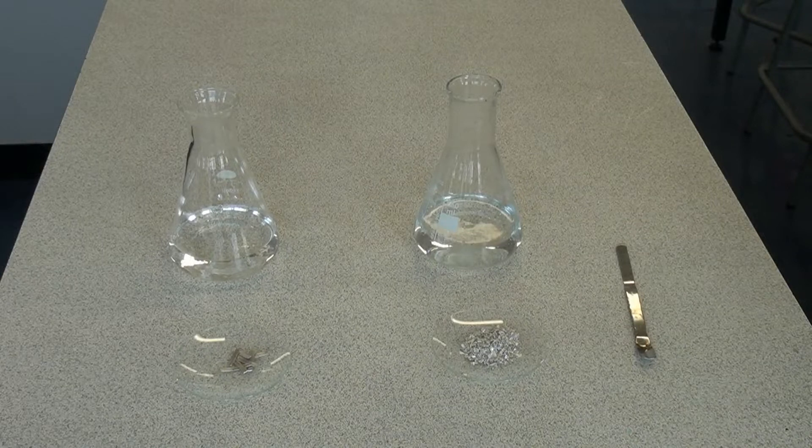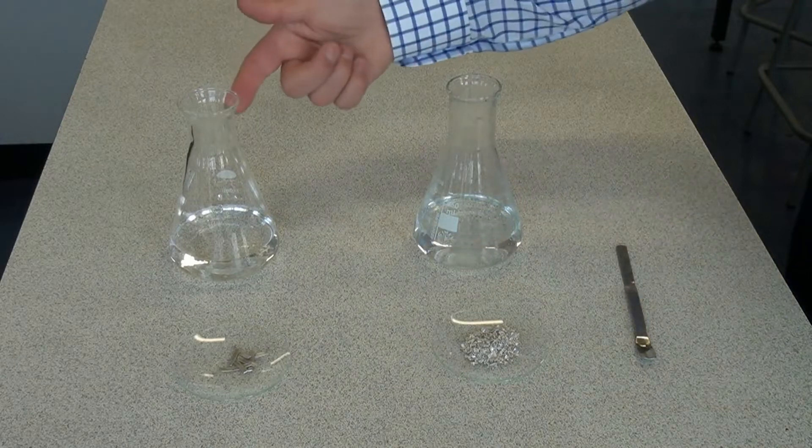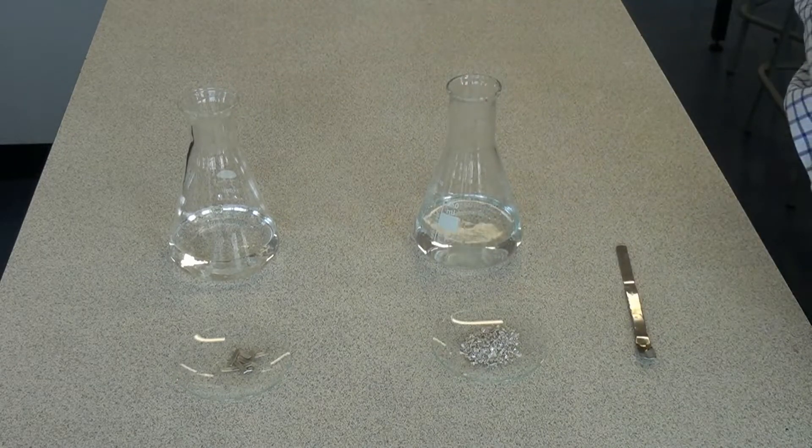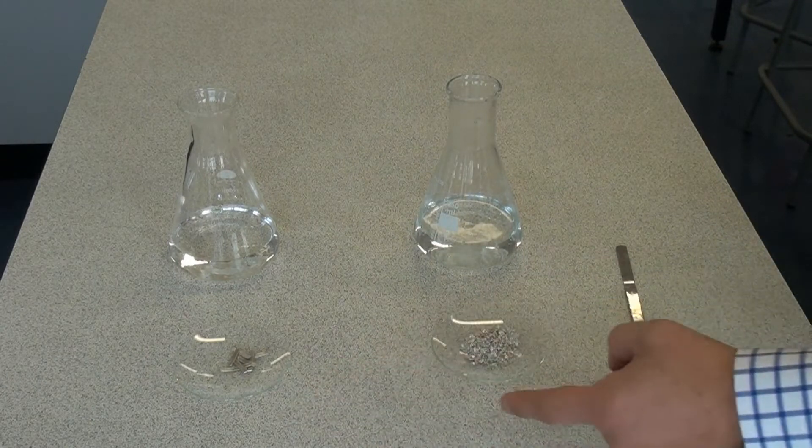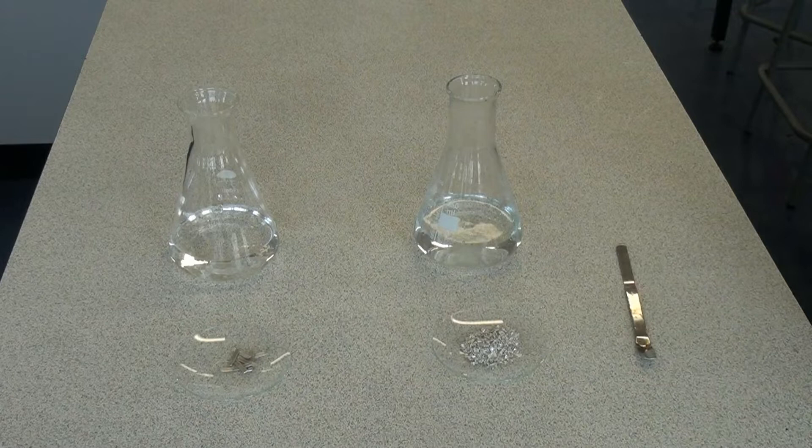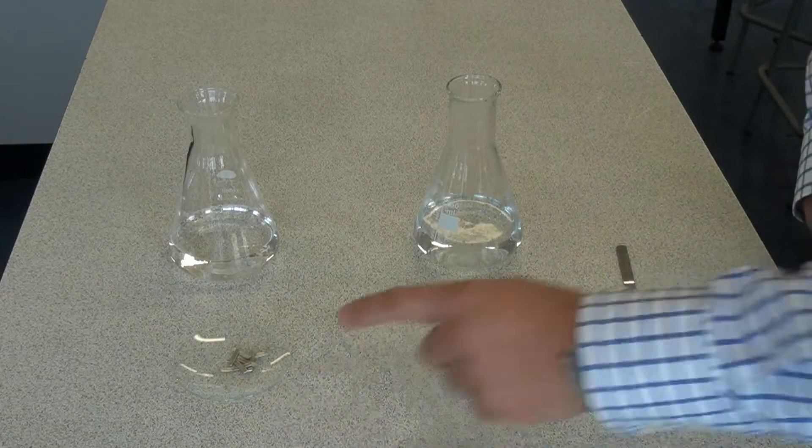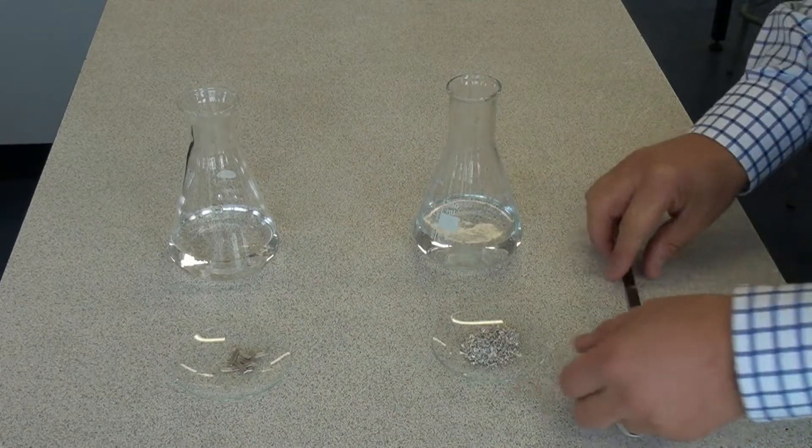So what do we mean when we talk about the rate of reaction? Let's have a look. So here I've got some hydrochloric acid in each flask, 100 cm cubed of each and it's the same concentration and here I've got two samples of magnesium. One sample is in small pieces, the other sample is much larger pieces of magnesium. So let's have a look what happens when we put them in with the acid.